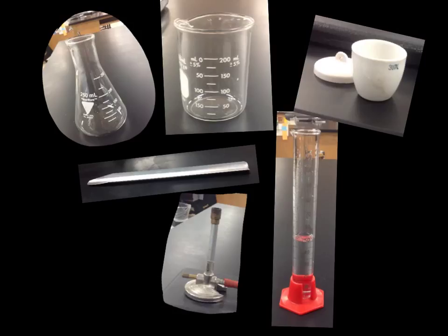This gives you a good idea of the lab equipment you're going to be using for the labs that we do in pre-AP chemistry. You need to make sure you know what they're called and what they're used for. We will introduce some other very specific lab equipment that might only pertain to one particular lab, but these are going to be the things that you're going to see most often. Thank you.